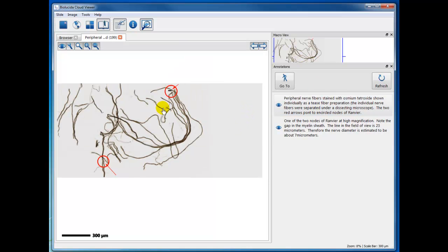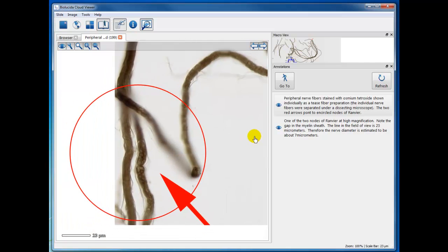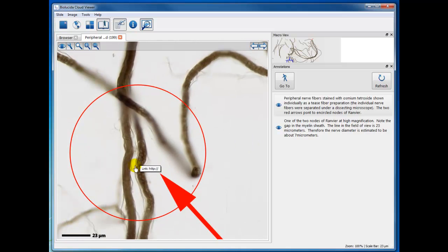We indicated a couple areas here that are encircled, and I see that we have an HTTP link to this, which I'm going to remove, but I can continue with this and click outside here. I didn't intend to put a link to a website here.